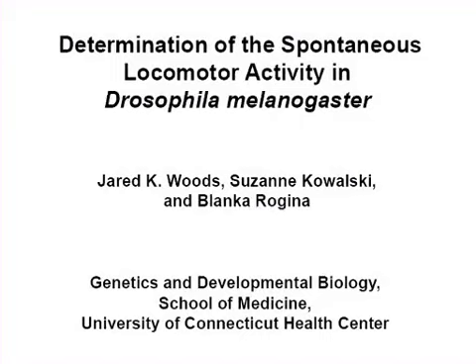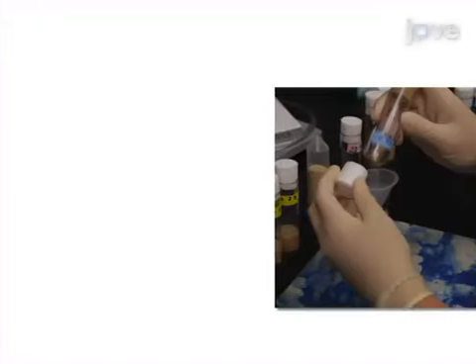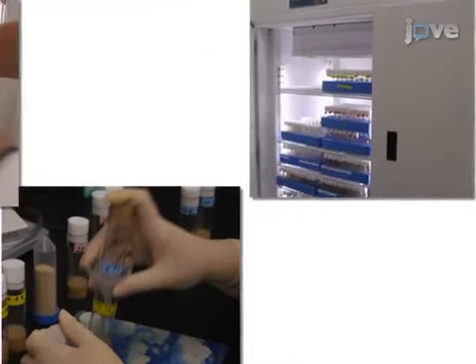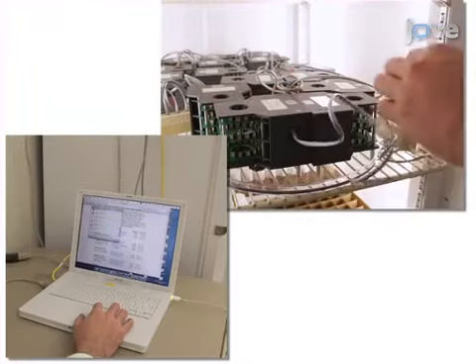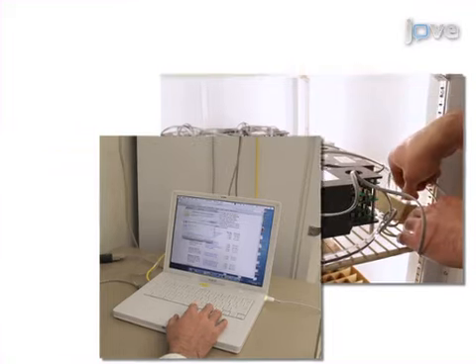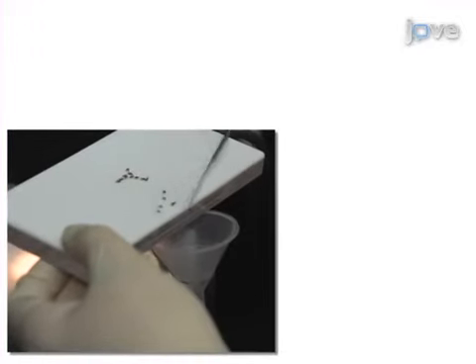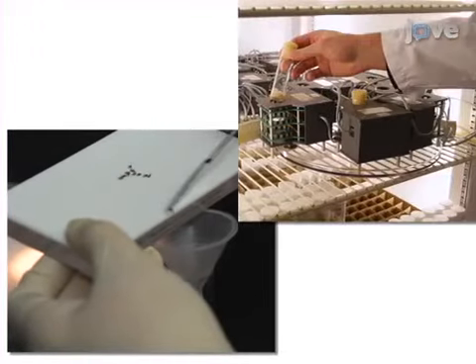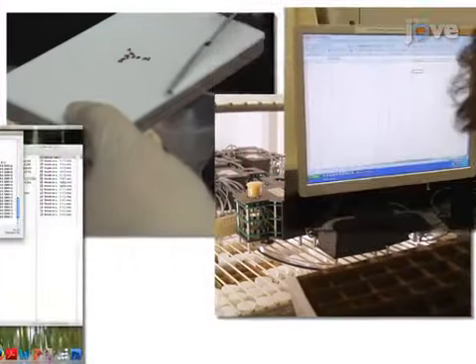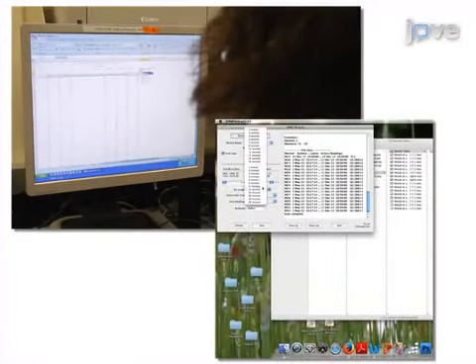The overall goal of this procedure is to quantify spontaneous locomotor activity of fruit flies. This is accomplished by first collecting and aging experimental flies. The second step is to set up population monitors in a temperature-controlled incubator and download the appropriate software. Next, the flies are transferred to glass vials and then placed inside population monitors where the activity monitors are run. The final step is to analyze the data.